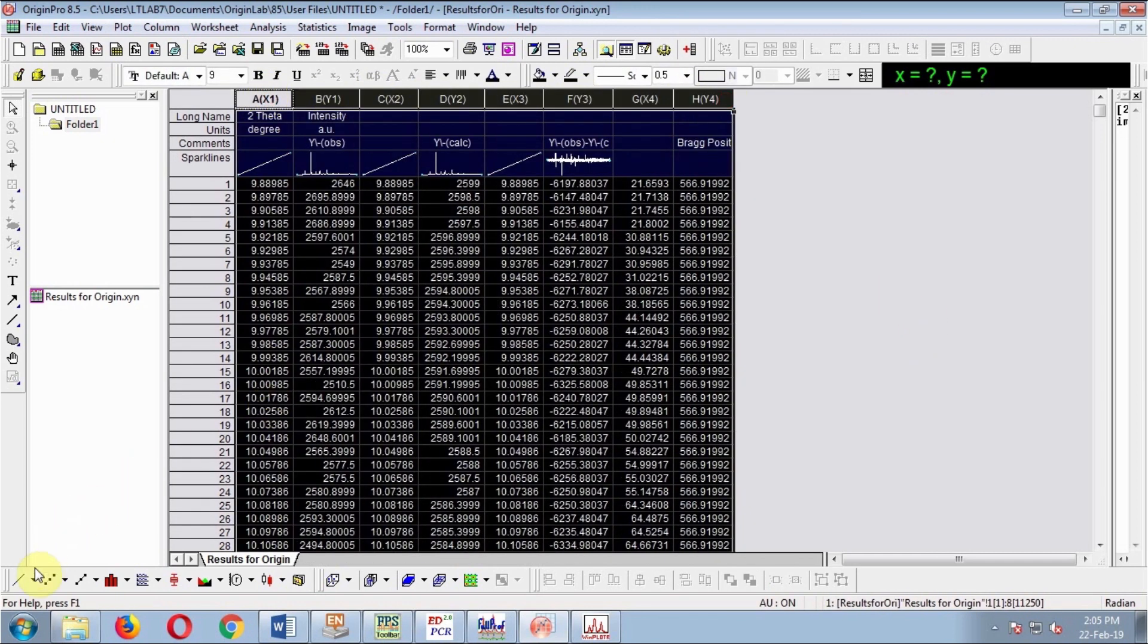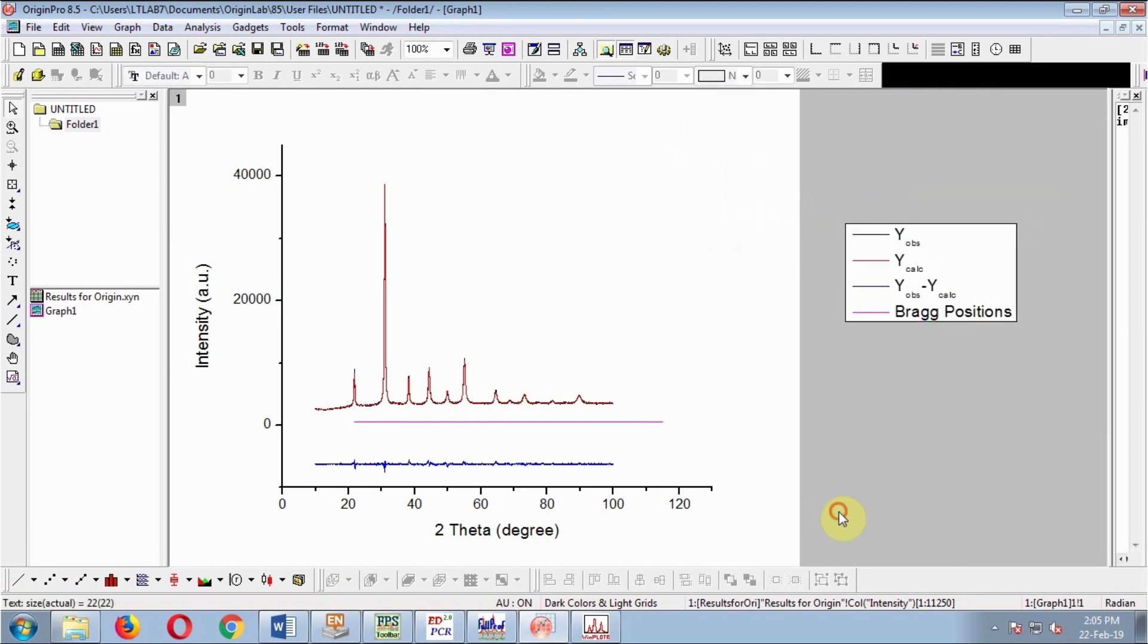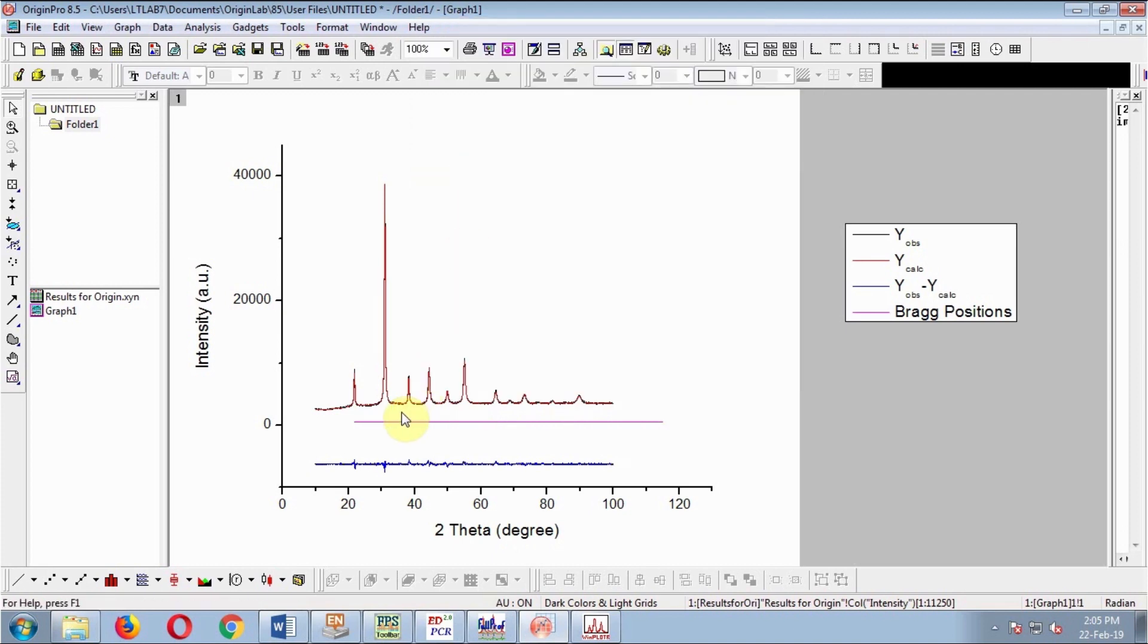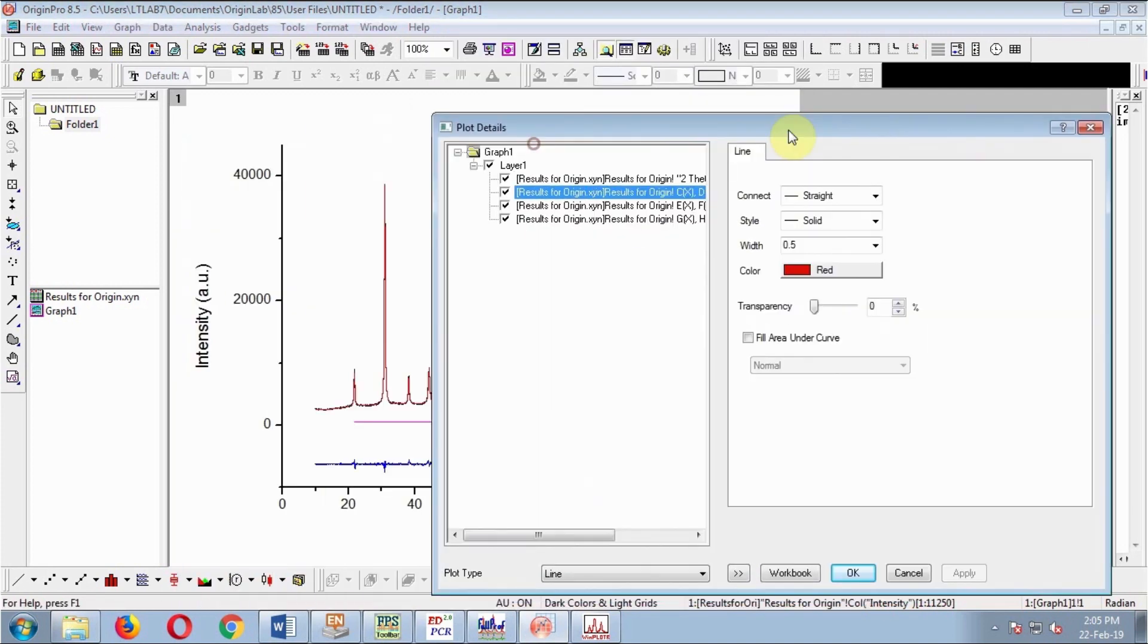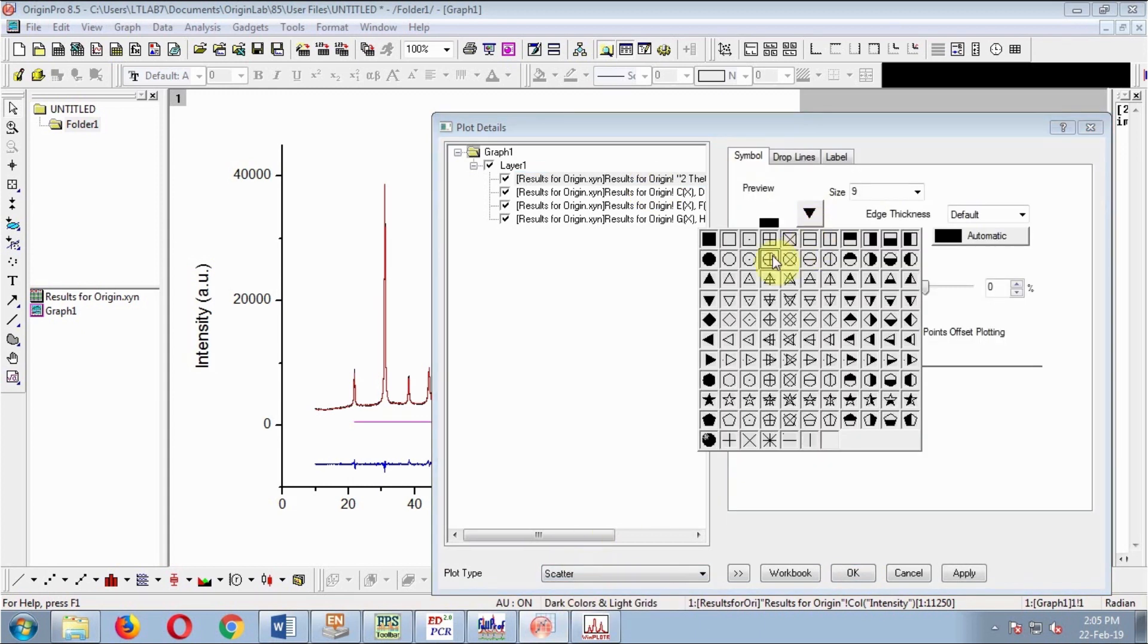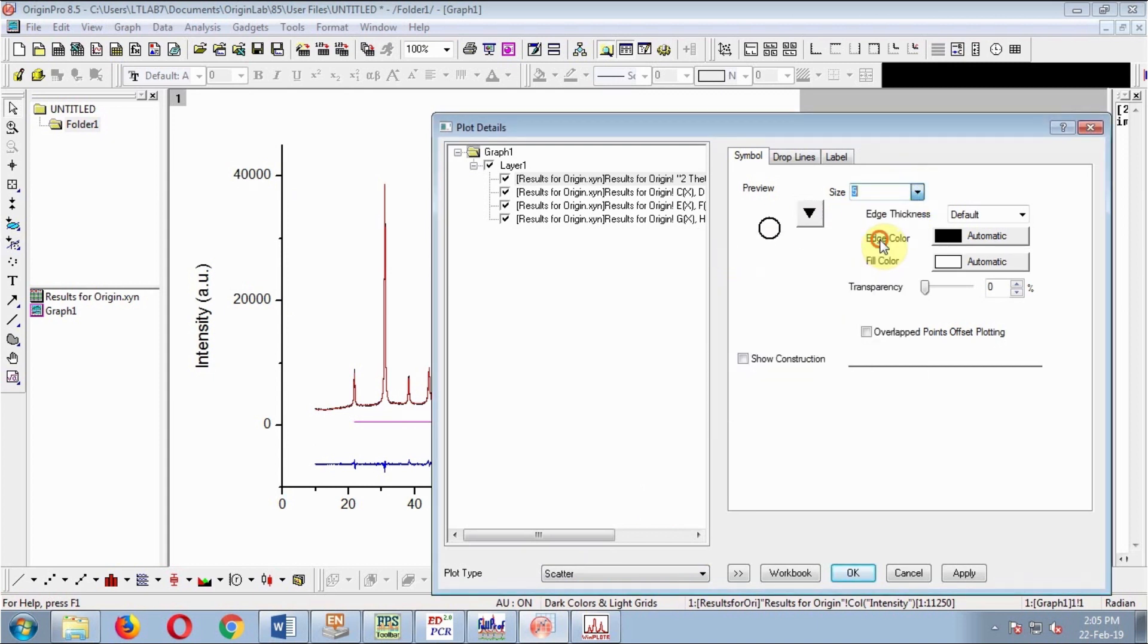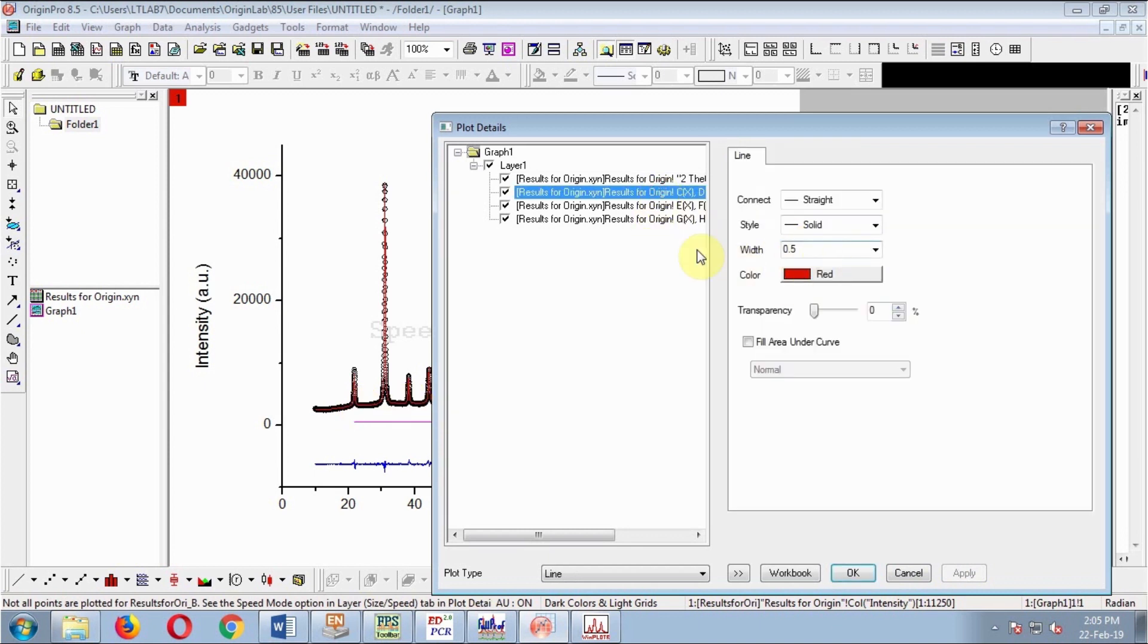Now plot these. Right-click on the graph and ungroup. Double-click on the graph. The first one is observed or experimental data—it's better in scatter format. Change symbol to open circle and decrease the size if you want. The second and third ones are fine.